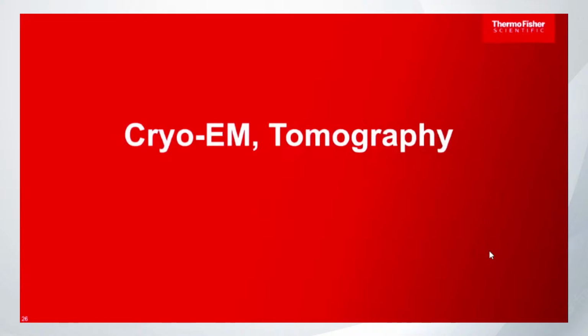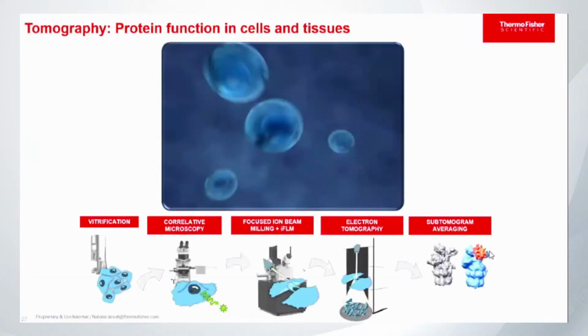And probably the dimer is the correct one because it's in the context of the cell. It's the real thing, the real stuff. So how to do that? Unfortunately, the process is a bit more challenging than single particle analysis, and I will explain to you how.